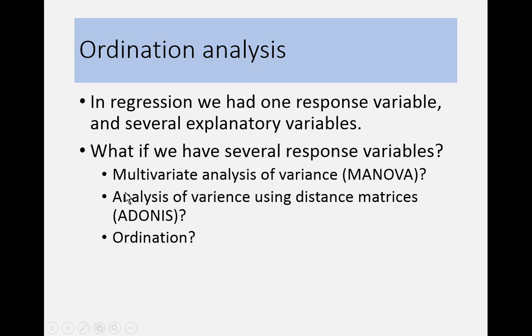There are other tools for that. One of those other tools is analysis of variance using distance matrices. We will come to it slightly later. But what people very often use is some kind of an ordination analysis.